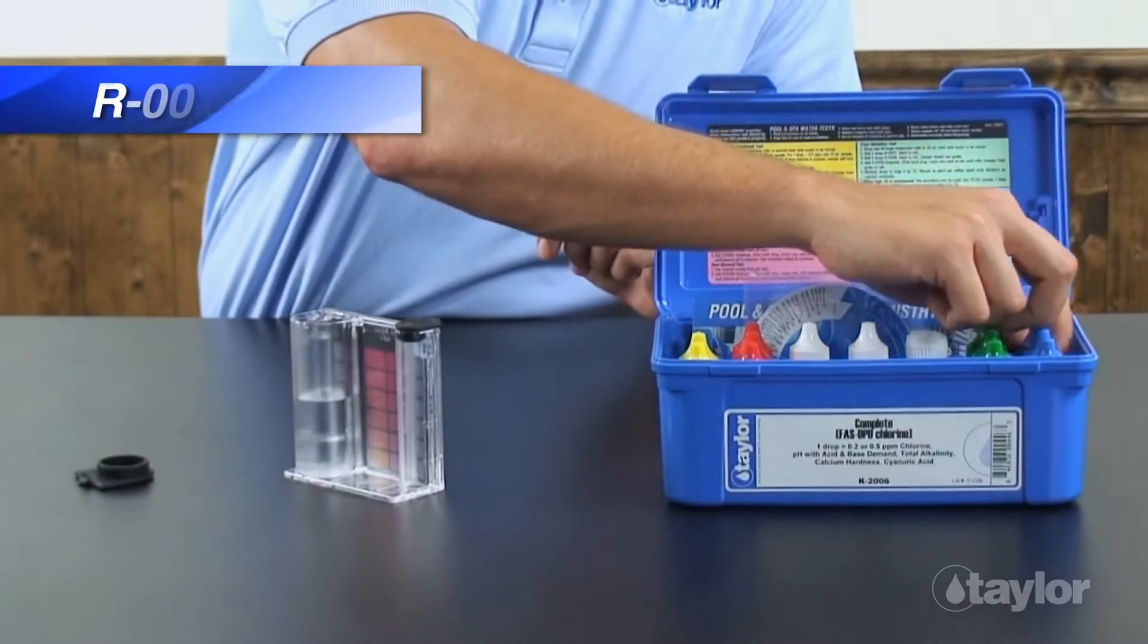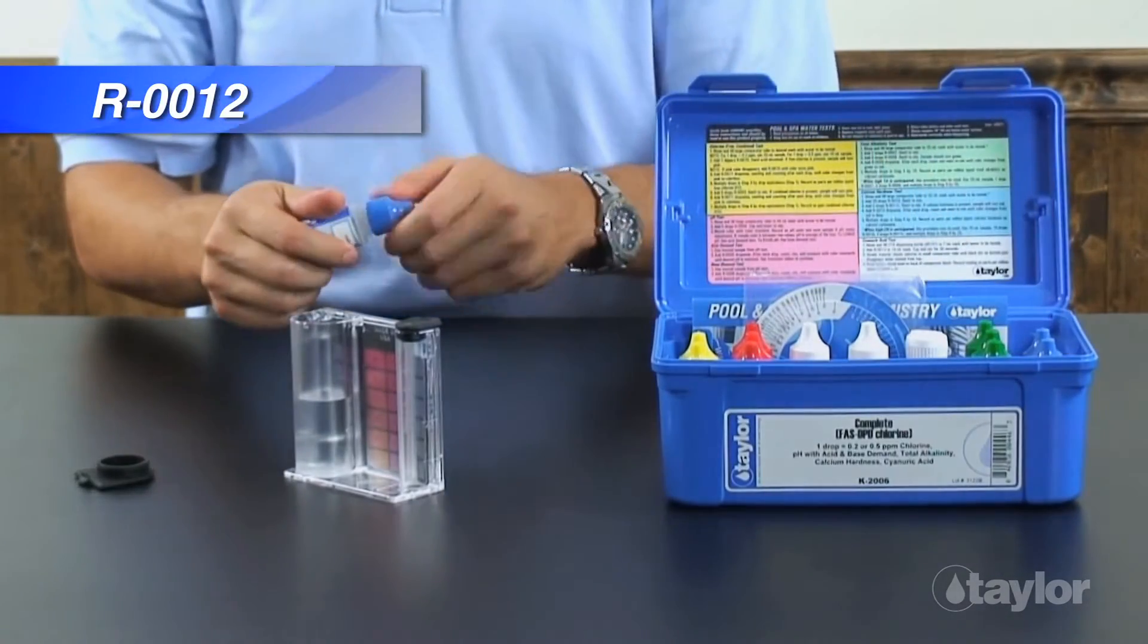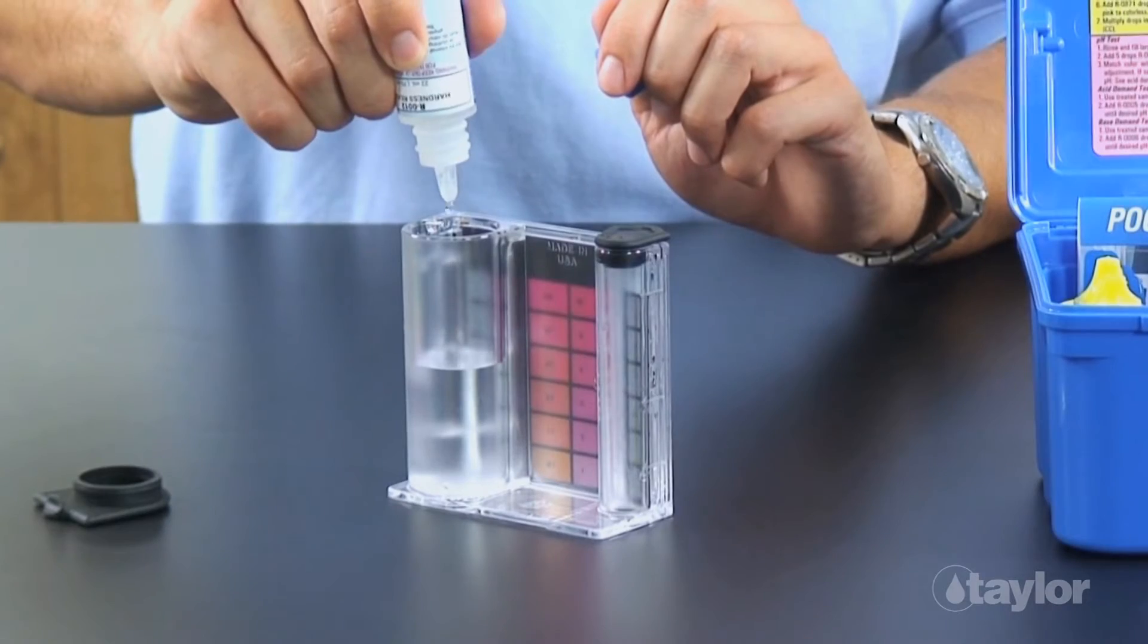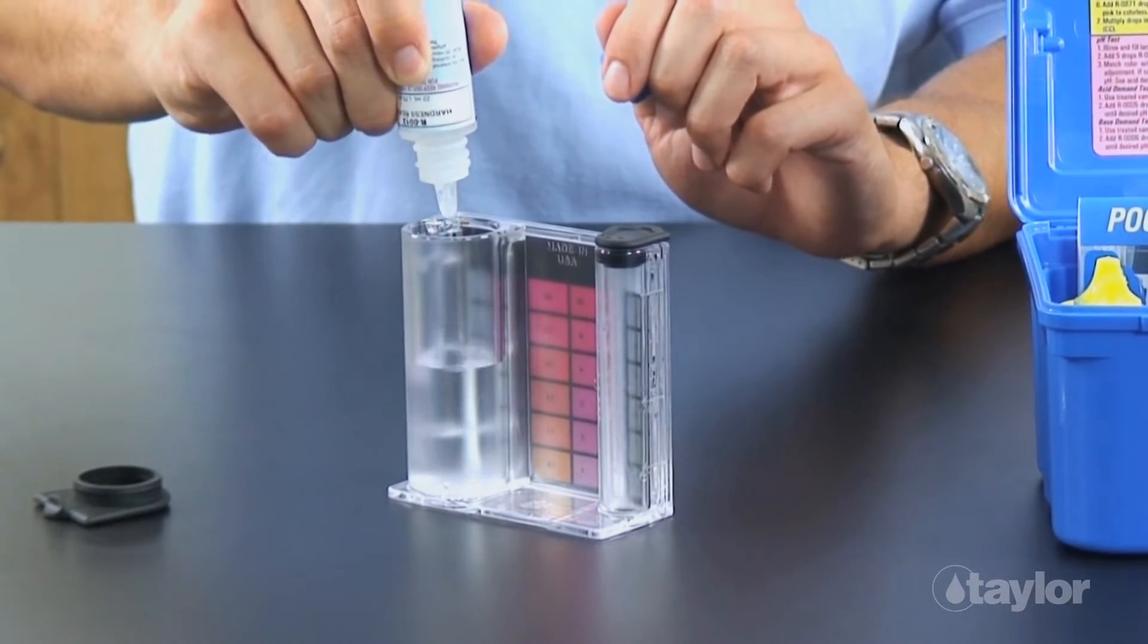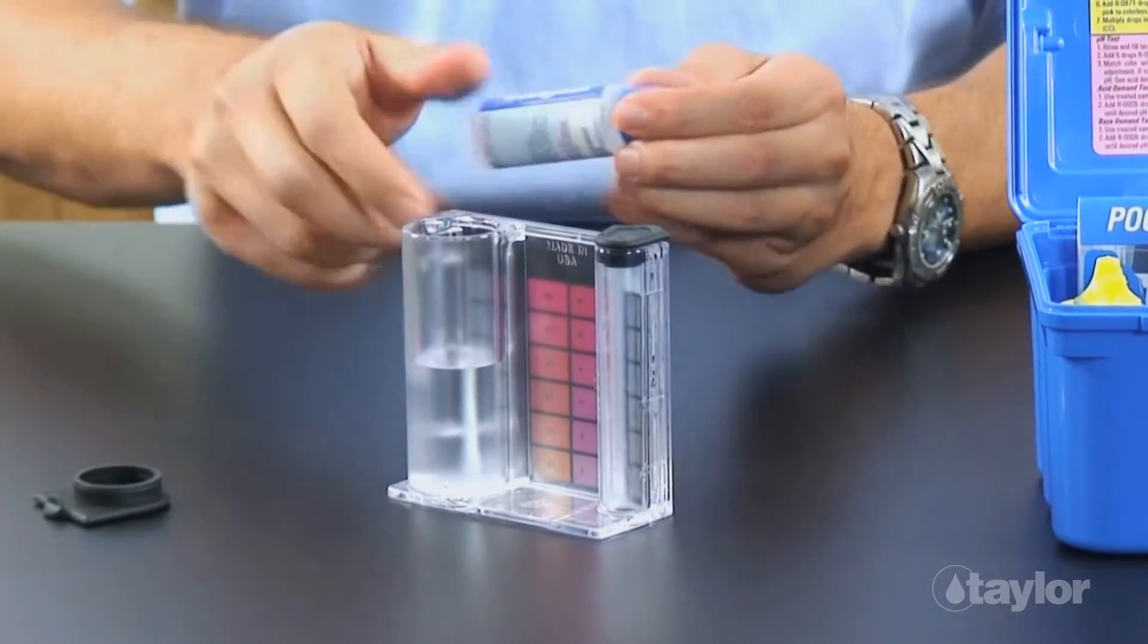Add 5 or 6 drops of reagent 12 to the sample before adding the buffer and indicator. Record the number of drops used. Swirl to mix.